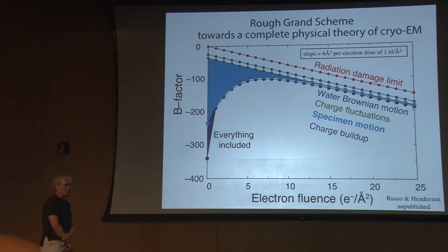So one thing about radiation damage: you have first plunge frozen your specimen, right? And then you are irradiating with the electrons. So at that point in time, is it not frozen? Do you have the specimen in the cryogenic medium? You mean at the first point when you freeze it? No, after the freezing, while you are irradiating, is it still in the cryogenic medium?